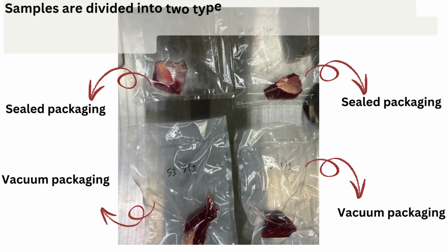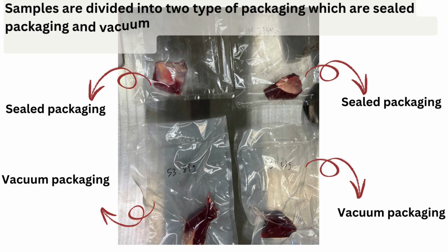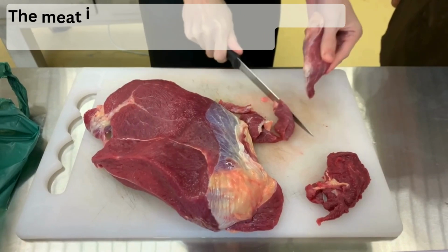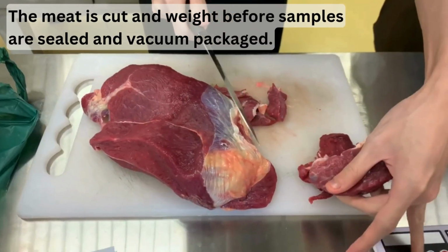Samples are divided into two types of packaging, which are sealed packaging and vacuum packaging, carried out at 3 different times: 0 hour, 3 hours, and 6 hours. The meat is cut and weighed before samples are sealed and vacuum packaged.